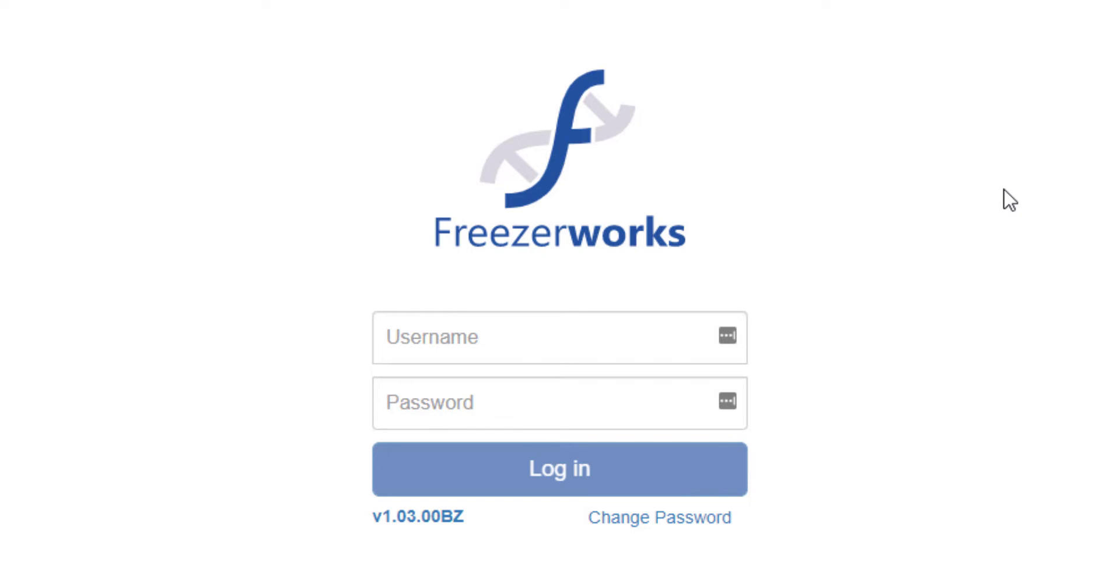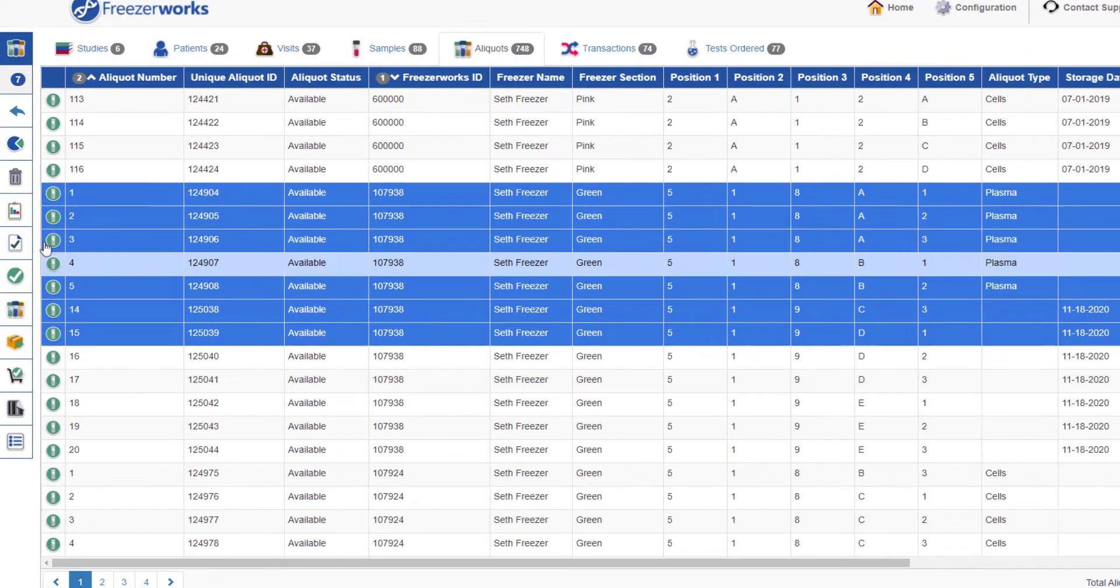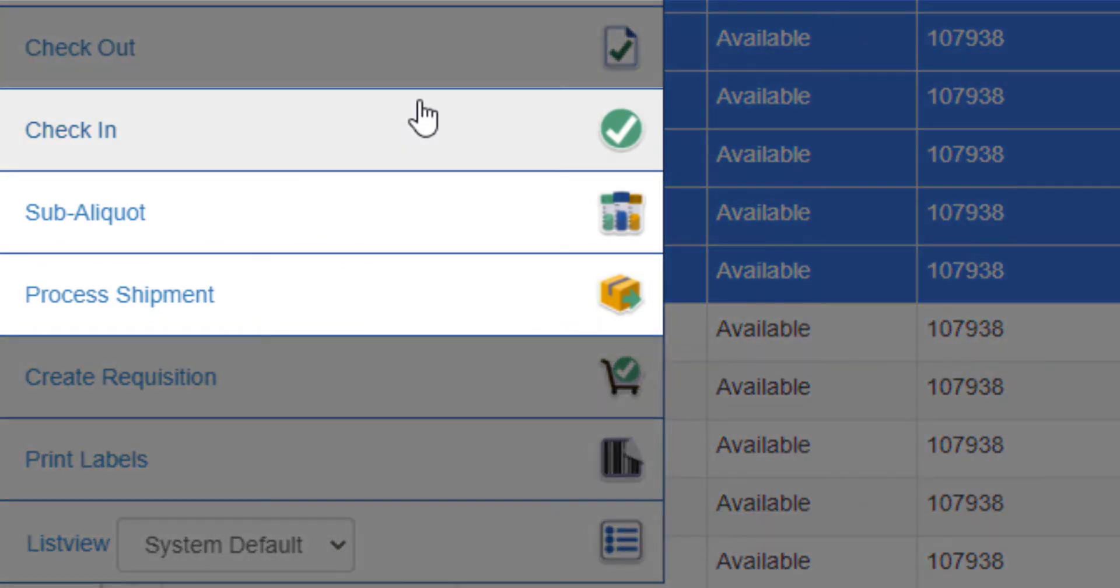Last time, I talked about the usefulness of workflows in Freezerworks before showing you what processing them is like on the web client by running through a checkout. We also have three other workflow types: check-in, sub-aliquot, and shipments.